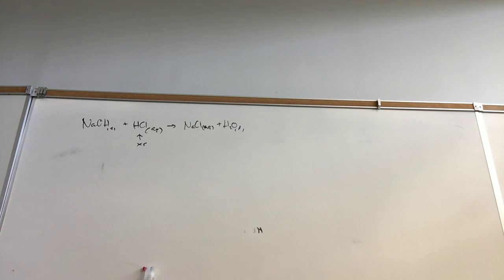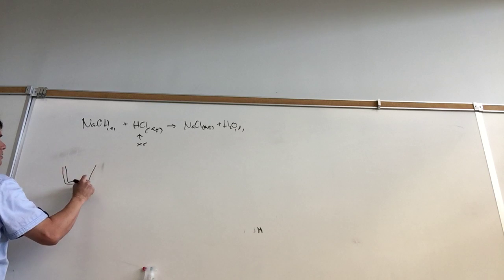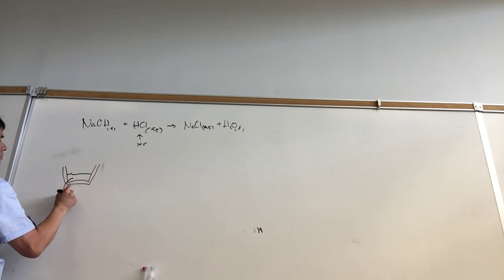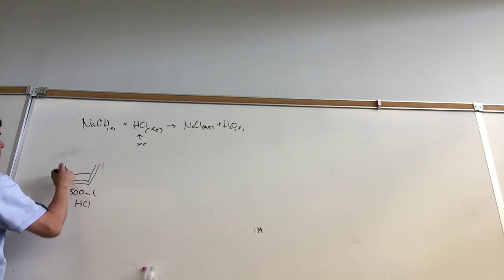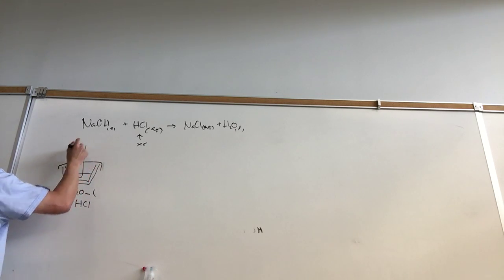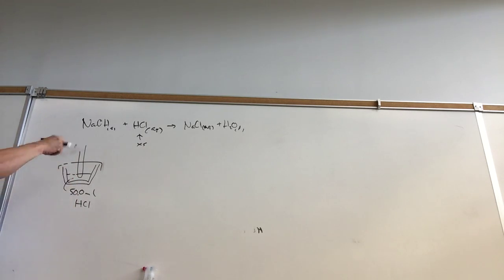In this case, we're going to use 50.0 mL of the HCl solution, and we're going to monitor the temperature of the 50.0 mL of HCl solution. At minute 6, we're going to pop the lid and then scrape in our sodium hydroxide and mix this up. Swirl it, mix it with the bar. Keep the lid on tight so you don't lose too much heat.